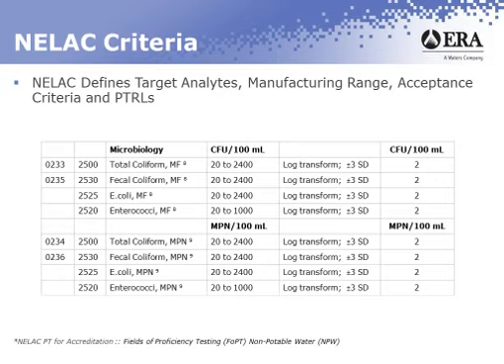The other thing that you see presented on this table is the PTRL. It's presented as the number 2 CFU or MPN per 100 mL. This is given to us by NELAC basically as a guide for the laboratory for PT samples.